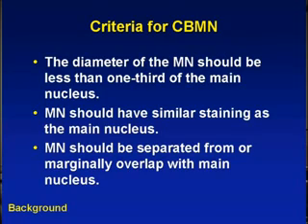Secondly, micronuclei should have similar staining intensity as the main nucleus. And you say, what the problem is that? The problem is that if the cell also has gone through apoptosis, and you all know that the apoptosis, you get the fragment of the nuclear material, and most time you can see this thing called the apoptotic body. It's also a very dense stained spot in the cytoplasmic region. And in that case, those are not micronuclei, those are apoptotic body. So they went through a completely different kind of process and mechanism. So for micronuclei, they should have similar staining intensity.